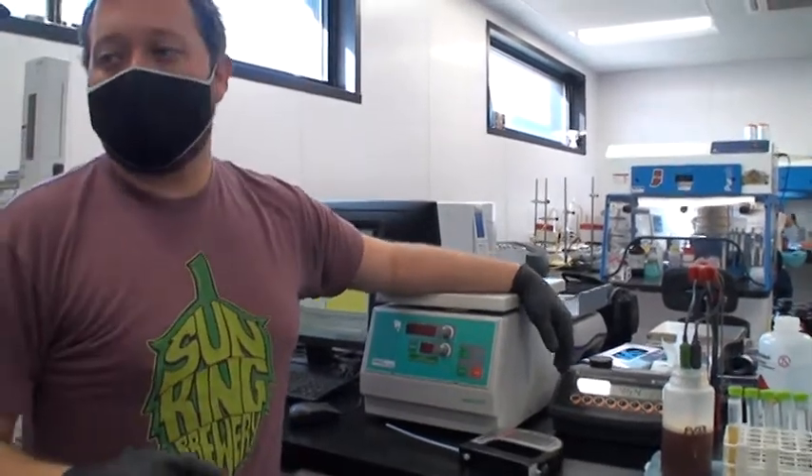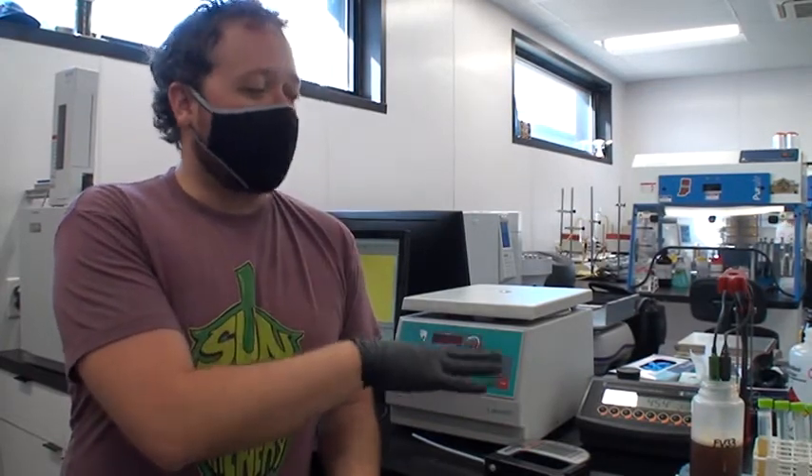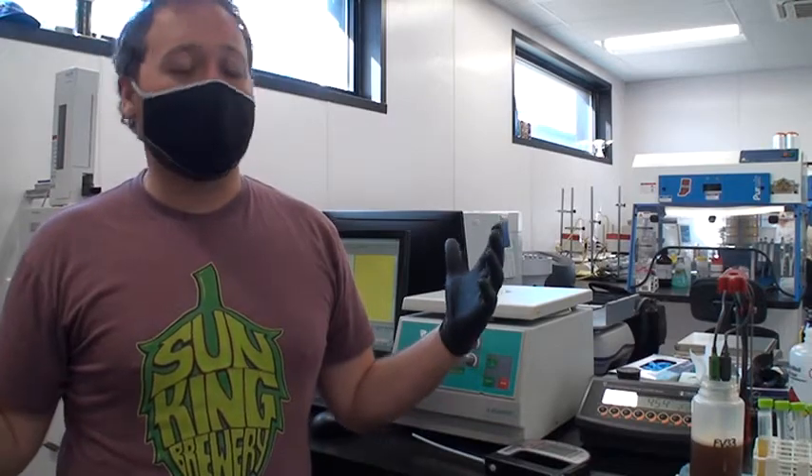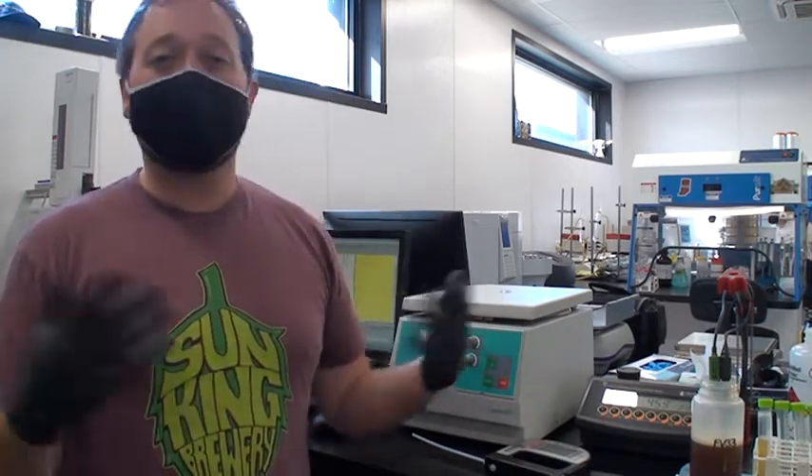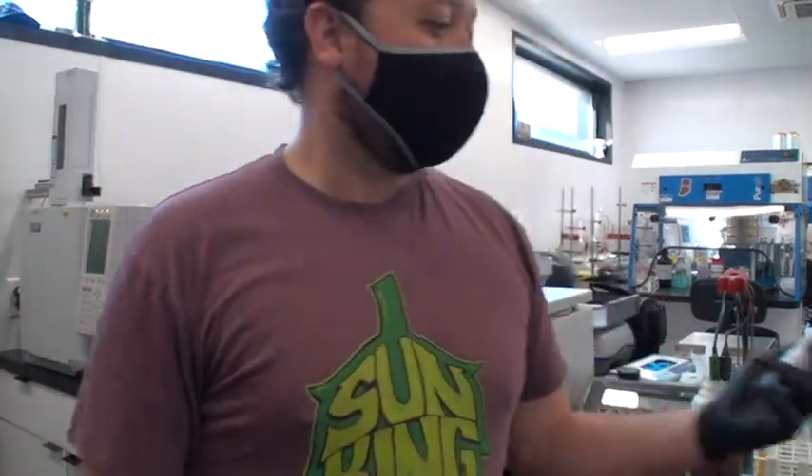At this stage we're partly checking more for fermenter cleanliness — you know your yeast is healthy from all the steps you took, but you don't know how the fermenter was left. If there are residues in there, that messes up the process. Similarly, tanks are acid-sanitized, so any acid left over will show a low pH. And if we see a beer three or four days into fermentation down at 3.5, that's a strong indication of lactic acid-producing bacteria — a sign of infection. Every beer depends on the day of fermentation for what the pH should be, and we track that range every day.